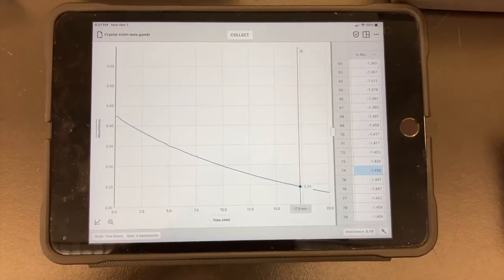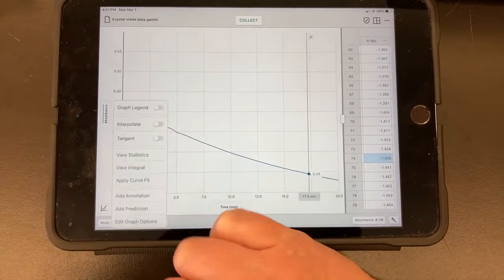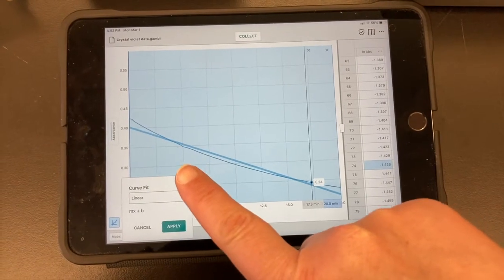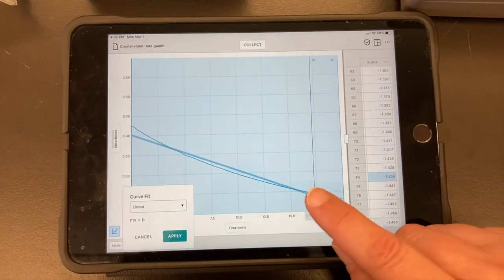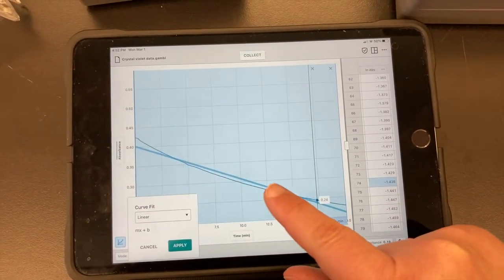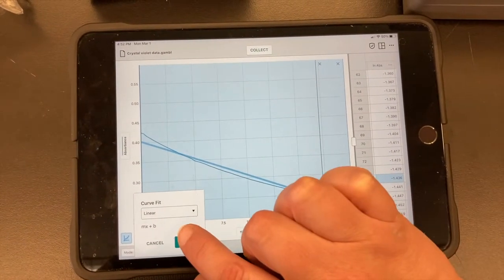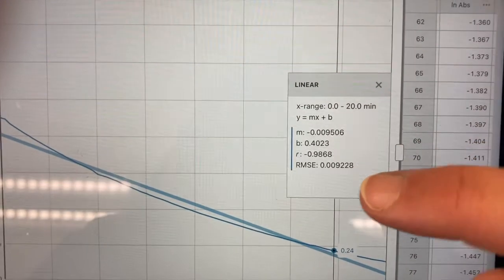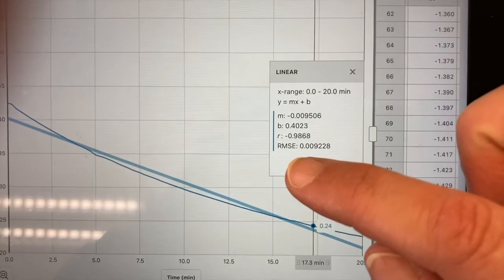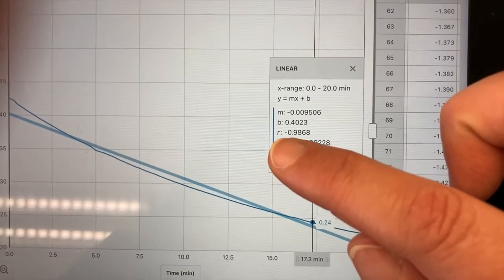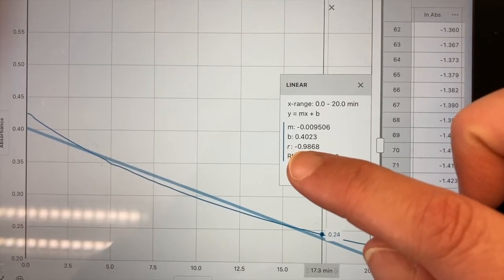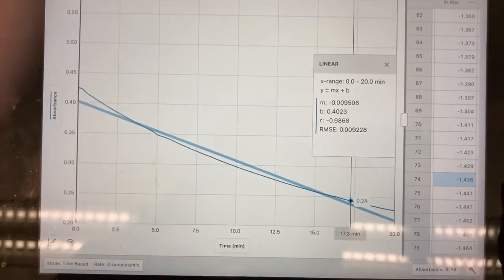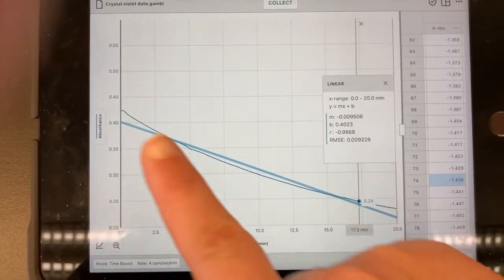So then for each of the graphs that we do, we are going to apply a curve fit. So again, click on the little graph in the corner and this time we are looking for apply curve fit. And so it is applying a linear fit. And so you can see that the points are above the linear line at the beginning and end and they are below in the middle and so that is an indication that this is curved. We can go ahead and apply that. And then we can pay attention to our RMSE, root mean squared value and we can look at our R value here. And so this is going to be negative because the slope is negative and then we can see it as 0.987-ish. So that is a pretty good correlation for some sciences, but for chemistry we are going to say it is not good enough, especially since we have this indication that it is probably curved.